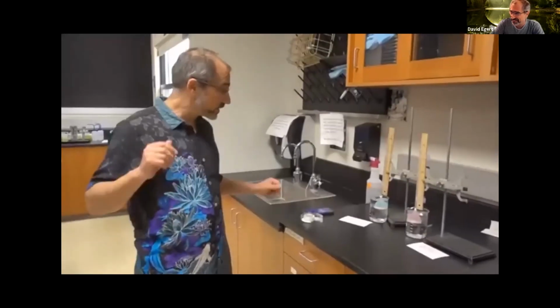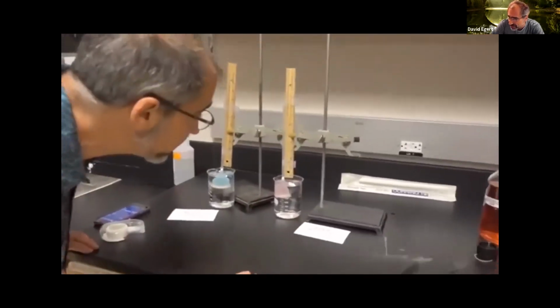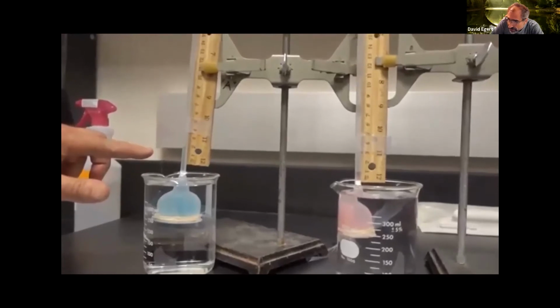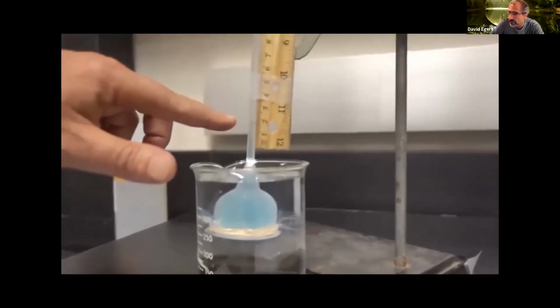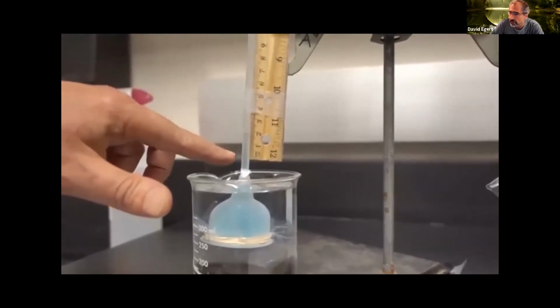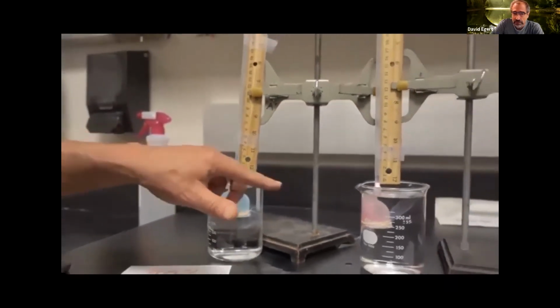All right, it's 10 minutes, and now I want to do my readings. The 40% has gone up quite a bit, actually. We're about 1.8 centimeters, or 18 millimeters, above 0. Remember, it was at 0 at time equals 0.